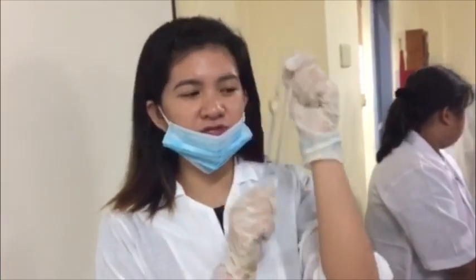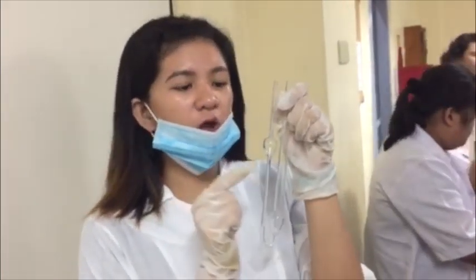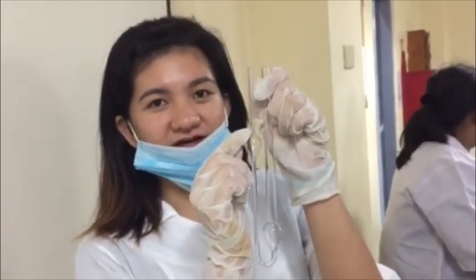Hi, so this is a viscometer. So I'm going to show you the parts of a viscometer. This is a reservoir, capillary arm, lower mark, this one, and the upper mark.